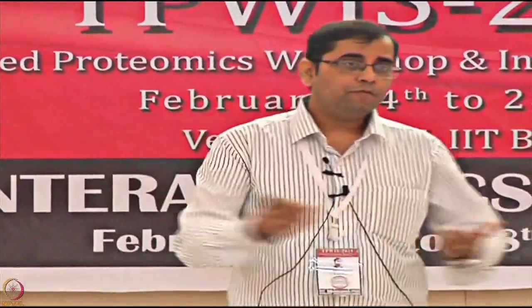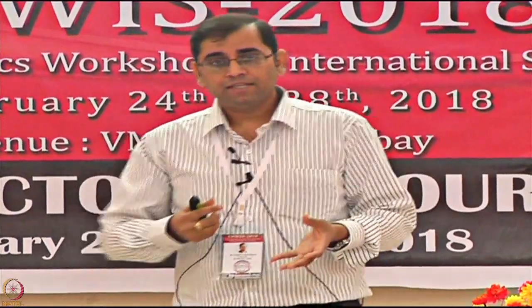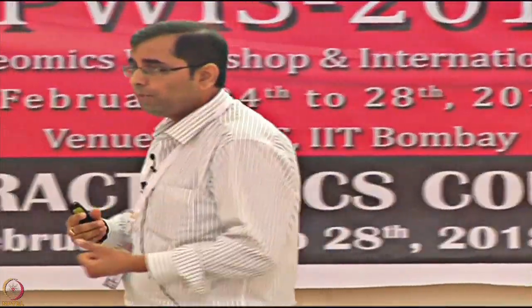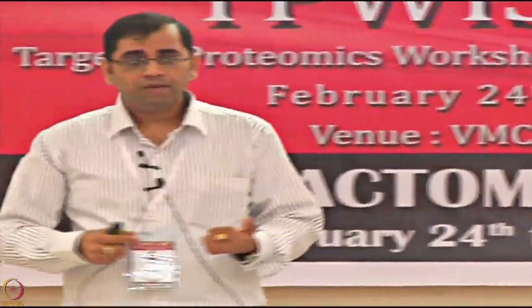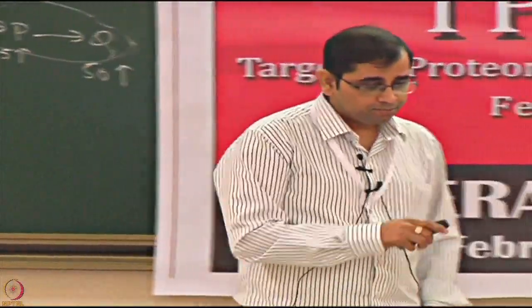And of course, you have different measures of having different controls which could be used to do the quantitation as well. But in this case, when you are talking about some of the label free platforms, you even have the ability to say that yes, binding is happening, but what the on rate is, what the off rate is, what the overall dissociation constant is, and how my kinetics is actually getting changed. So these are the added information on top of what you would only obtain in the microarray based or any kind of label based platform. So that is the added advantage of the label free technologies.